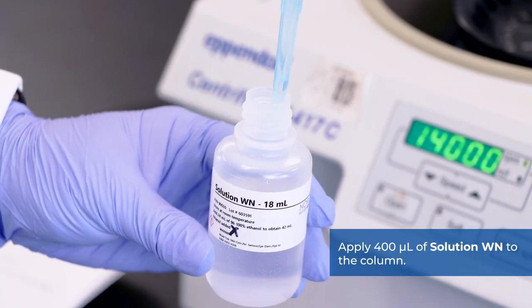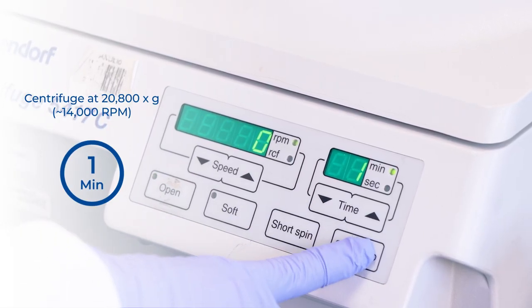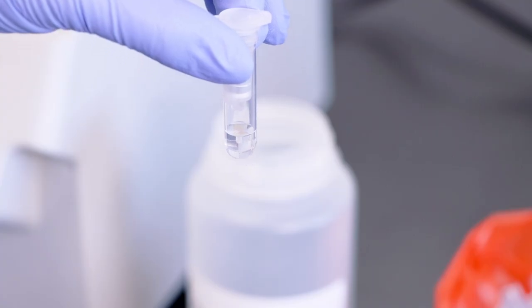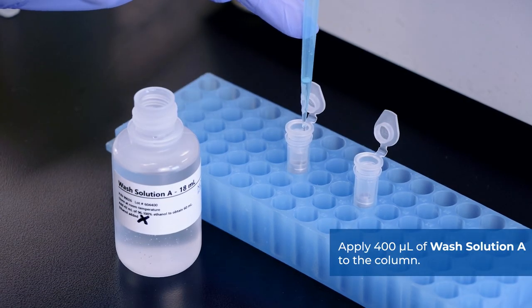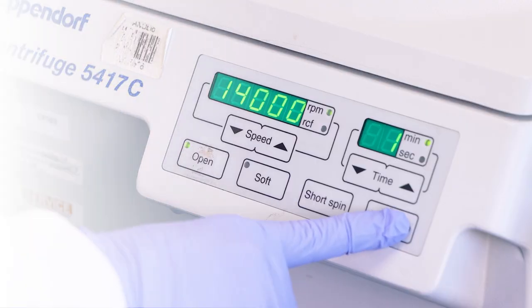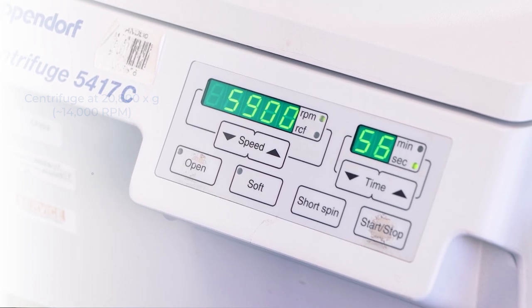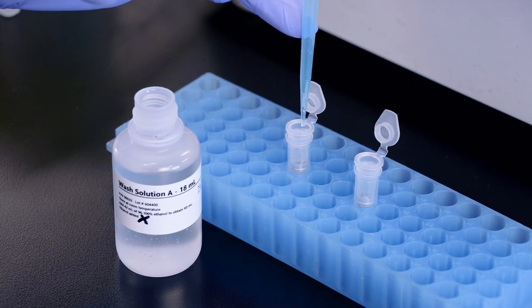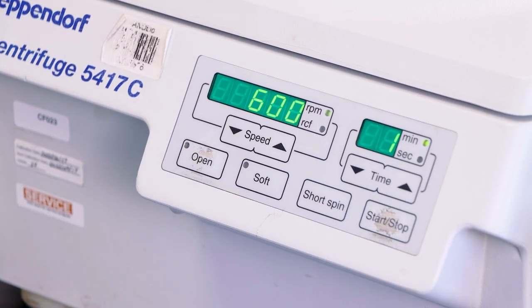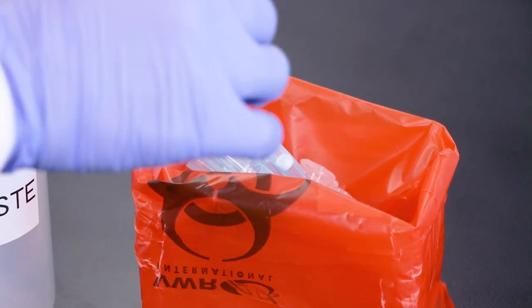Apply 400 microliters of solution WN to the column and centrifuge for 1 minute at 14,000 RPM. Discard the flow-through and reassemble the spin column with its collection tube. Apply 400 microliters of wash solution A to the column and centrifuge for 1 minute at 14,000 RPM. Discard the flow-through and reassemble the spin column with its collection tube. Wash the column a second time with wash solution A. Spin the column for 2 minutes in order to thoroughly dry the resin, and discard the collection tube.